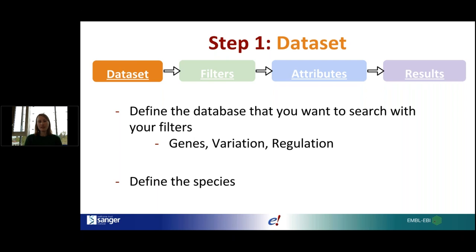The dataset is the database within Ensembl you want to search, plus the species of interest. There are three Ensembl databases you can search: the genes database, the variation database, and the regulation database. The variation database contains genetic variants, and the regulation database lets you extract information on regulatory features that have been annotated.